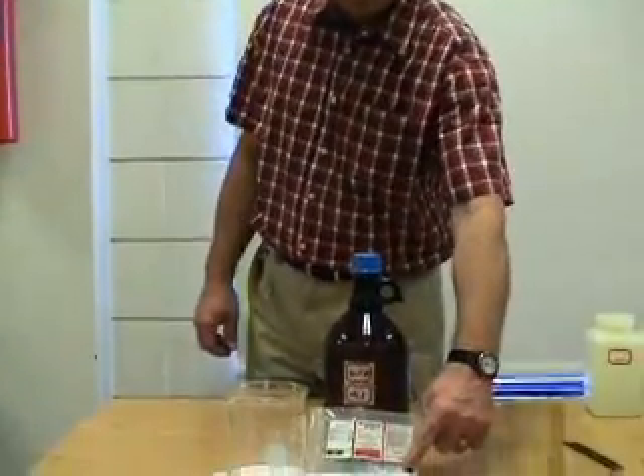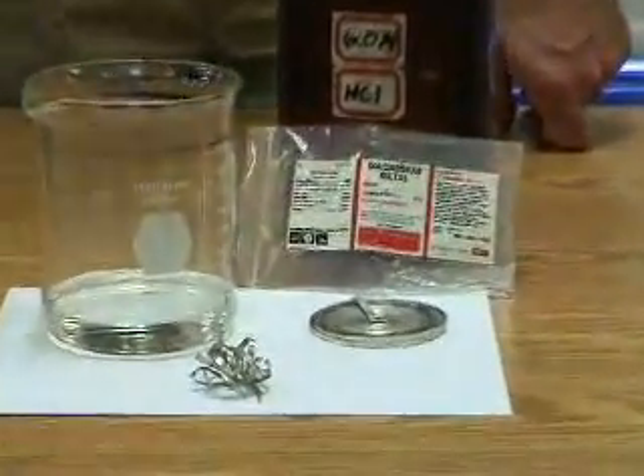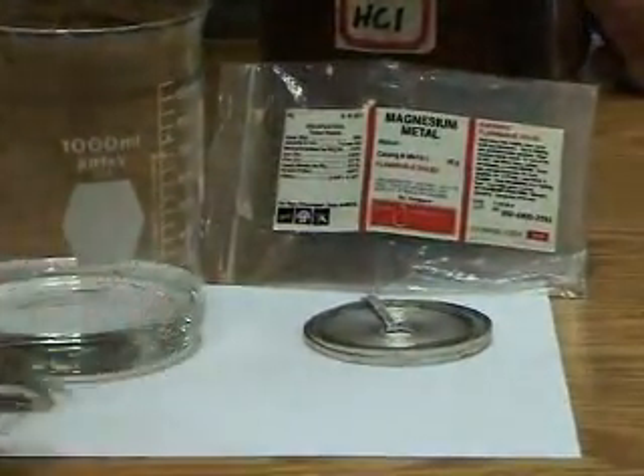We're looking at a single replacement reaction here between the metal magnesium and hydrochloric acid. The magnesium comes in a roll, and I've torn a piece off and crumpled it up, and we've put 6M hydrochloric acid into the beaker and let the reaction begin.